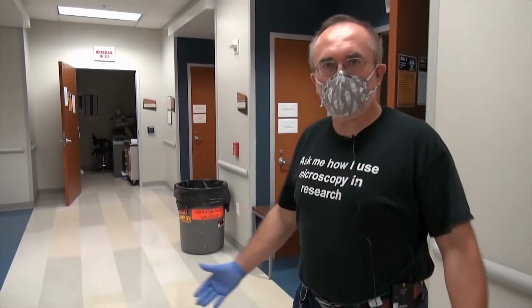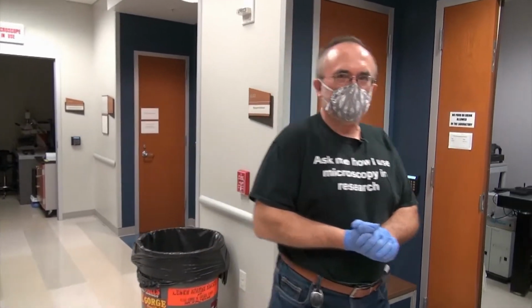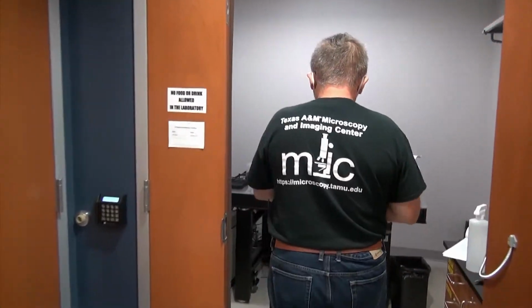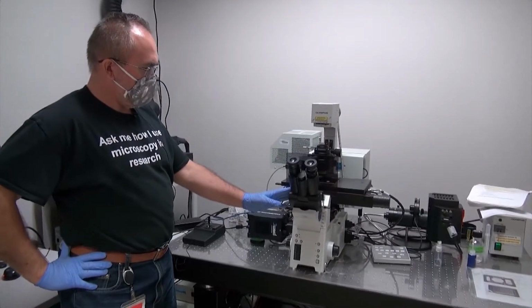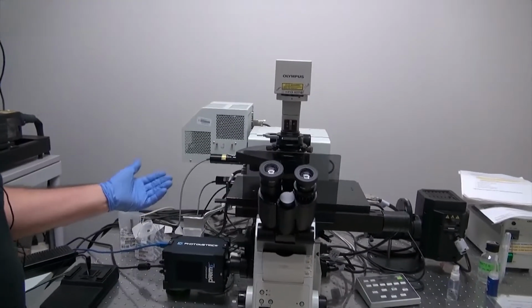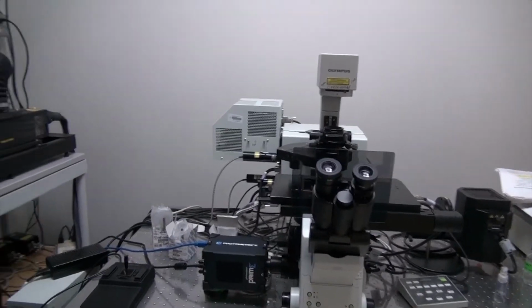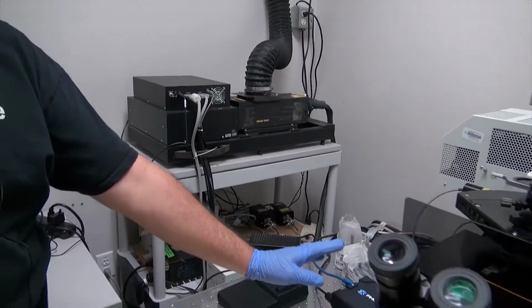So now that we covered mostly electrons, let's look at some instruments that deal with photons. Our Olympus FluoView 1000 confocal microscope is equipped with multiple lasers, and it can also function as a regular fluorescent microscope.